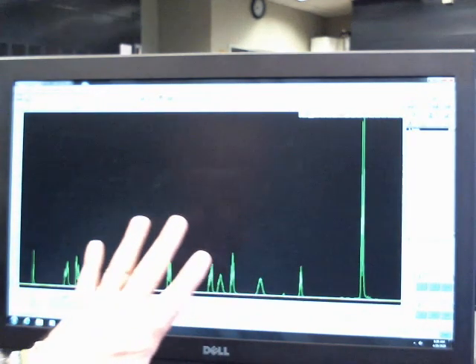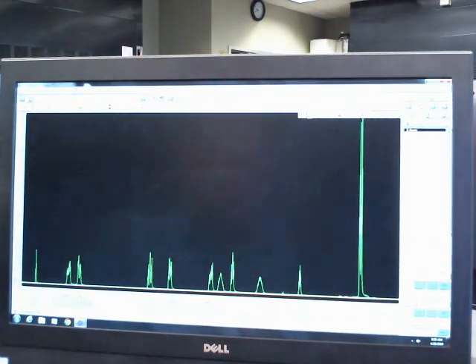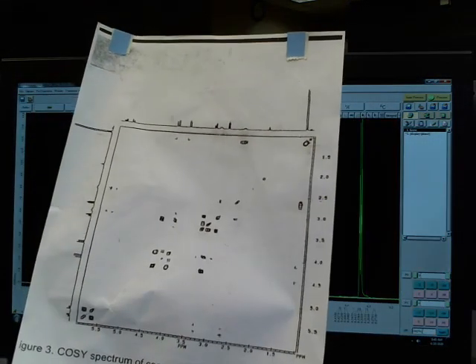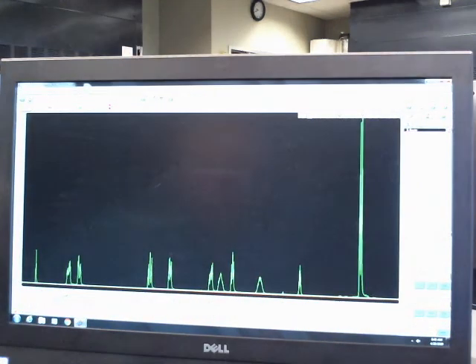So now we're looking at the actual experimental data, because we know how to measure J's. When we're looking at this compound, we're going to be able to find the two resonances that are important to get J values from. By this point, we will have already talked about the COSY, which allowed us to identify the two proton resonances.